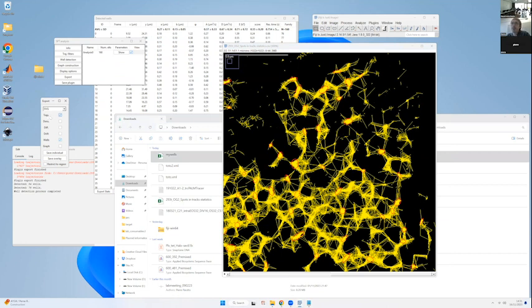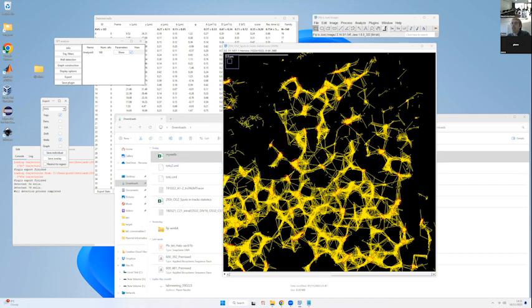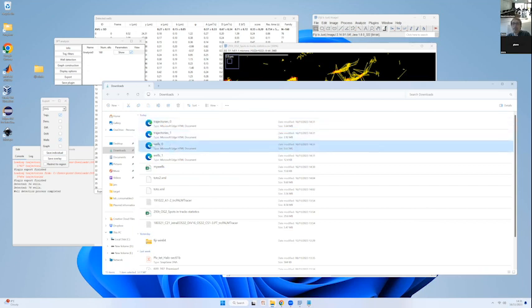If we select Traj and wells, we can either save individual, so here we need to provide a folder, and if we choose save individual, what it does is export the trajectories on themselves and export the wells on themselves in two different images.